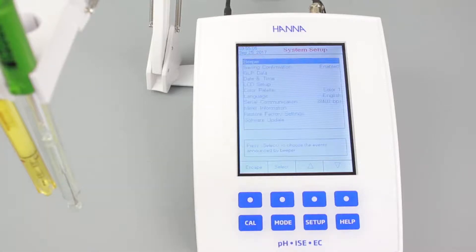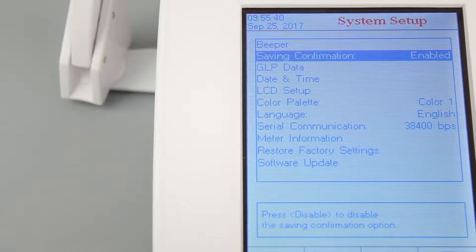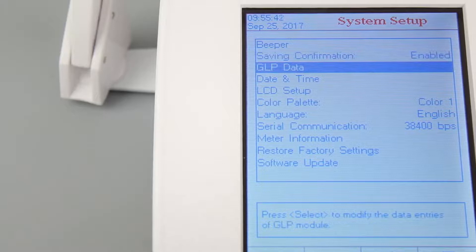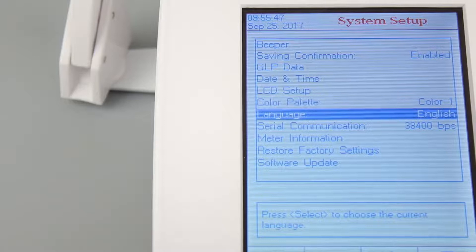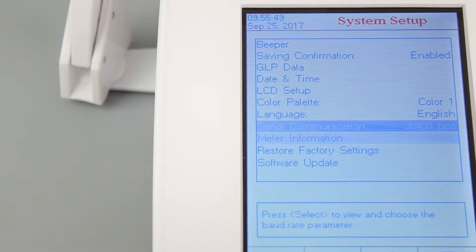This area of the menu lets you set the date and time, GLP data, and LCD settings. You can also view information about your meter and other operational preferences that you can set to your liking.